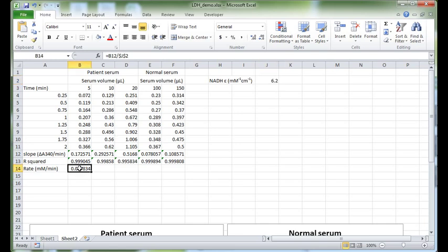So if we come back to our calculation for the rates, instead of $J$2 here, we can type dinosaur. You can see how Excel has recognized that dinosaur refers to J2. It's labeled green, and it's highlighted J2 green as well.